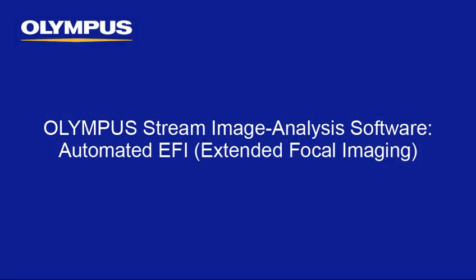This tutorial is one of many instructional videos presented by the Olympus Industrial Equipment Group. This tutorial video will provide you with detailed instructions for generating EFI or extended focal images within the Olympus Stream image analysis software.